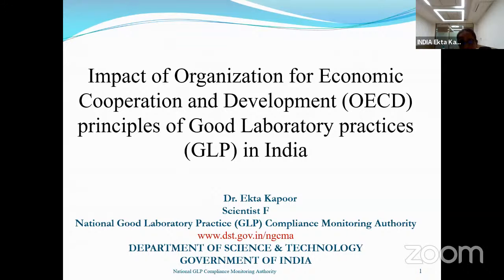So with this, I was listening to the previous lecture on mass spectroscopy, wonderfully explained by the speaker. Basically what all research in major types of chemicals, the pharmaceuticals and medical devices, need today is retraceability and reconstructability of the data, so that the data can be relied upon by the regulatory authorities.